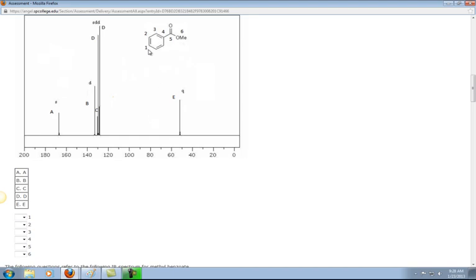So first of all, I'll look at 1, and I can see 1 is going to be an aromatic carbon, and it's going to be in this region according to the correlation chart. Now you'll notice that there are a number of doublets here. These each have one hydrogen on them, and we can actually distinguish a little bit between them. What we know about these two, 2 and 3 relative to 1, is that there's 2 2s and 2 3s, so I would expect that those might produce higher peaks than this one would.